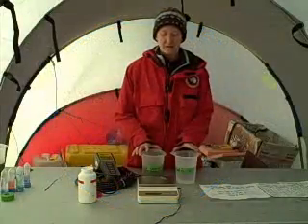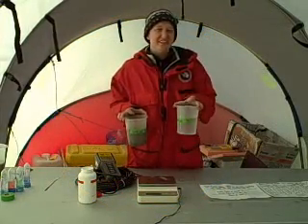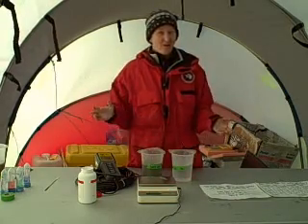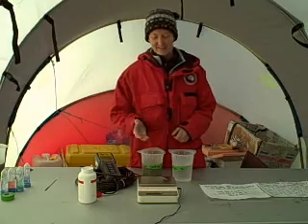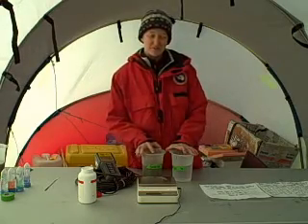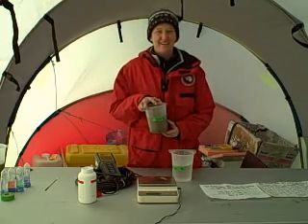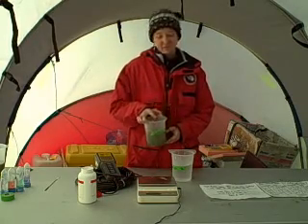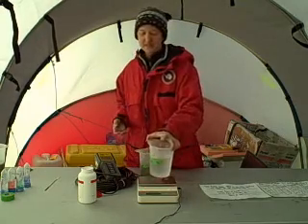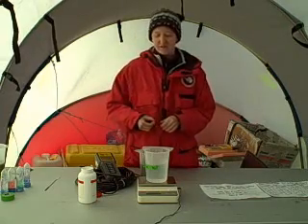In our last experiment, we learned that dirty ice has a lot more salt in it than clean ice. So now our next question is how much more salt is in the dirty ice than in the clean ice? To do this, we're first going to take the conductivity of the dirty ice. Once we have that measurement, we're going to take our clean ice beaker, place it on the balance, and take a measurement of how many grams that is.